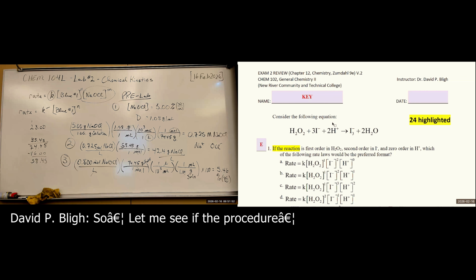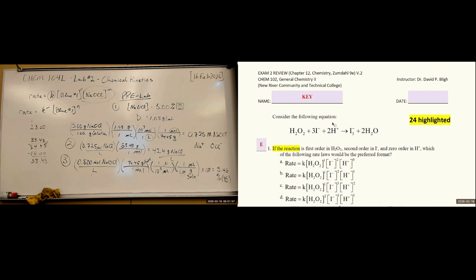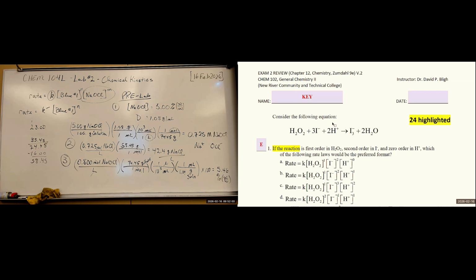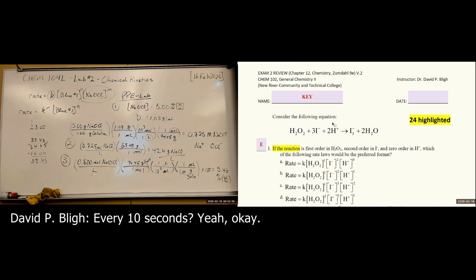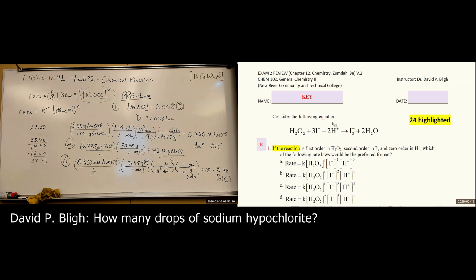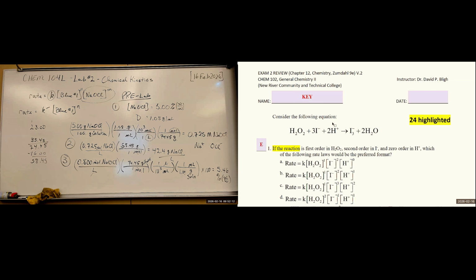So let me see if the procedure does what I think it's going to do. Every 10 seconds, yeah, okay. How many drops of sodium hypochlorite?